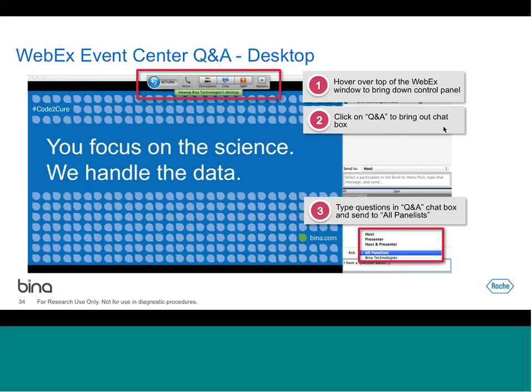Right. So maintaining consistency in the classifier and the test data you apply to is, in a way, very critical. If you build your classifier based on certain mapping, certain parameters, versions of the tools, then you should also run your test data based on the exact same workflow.